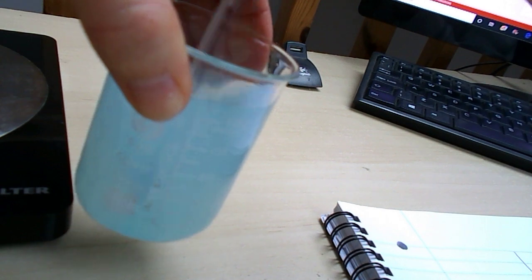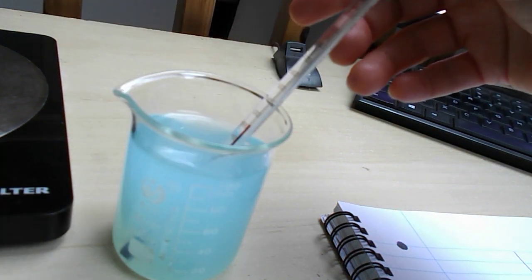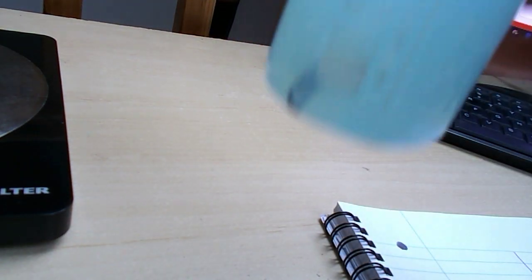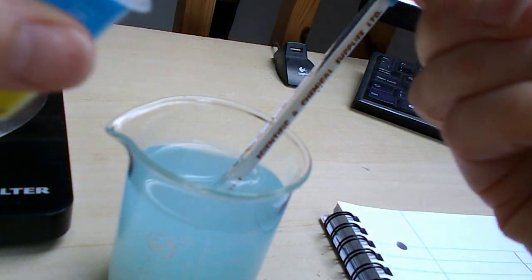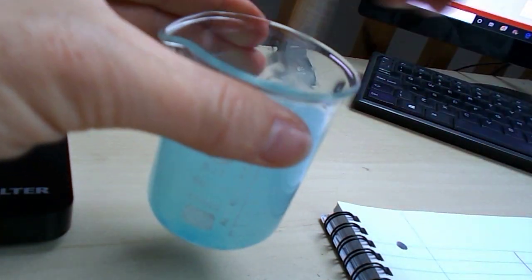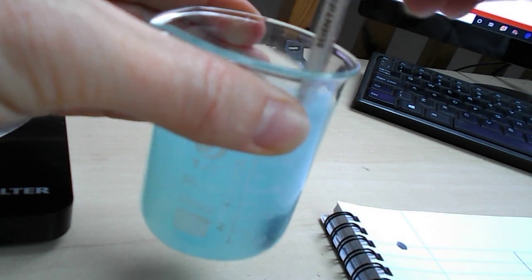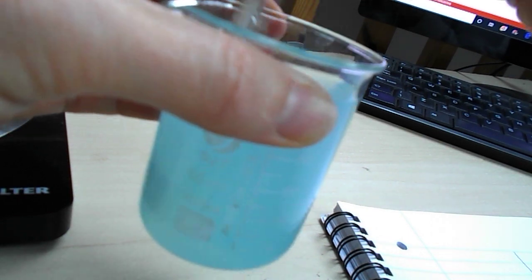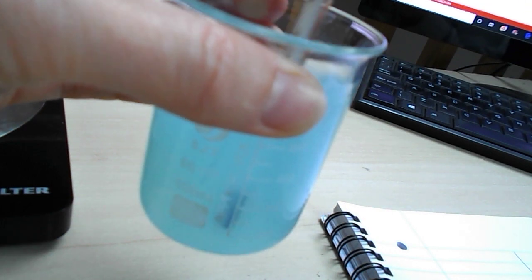Now remember, we're wanting to find out what the maximum amount of solid we can dissolve at room temperature is. So if I've given that a good stir and I can't see any more solid particles left in there, which I can't, I'm going to add a bit more copper sulphate. So I'll put another shovel in there, and then I'm going to give that another good stir. I will carry on doing this, adding a small amount and giving it a good stir, then another small amount and another stir, until I can't get it to dissolve any more.